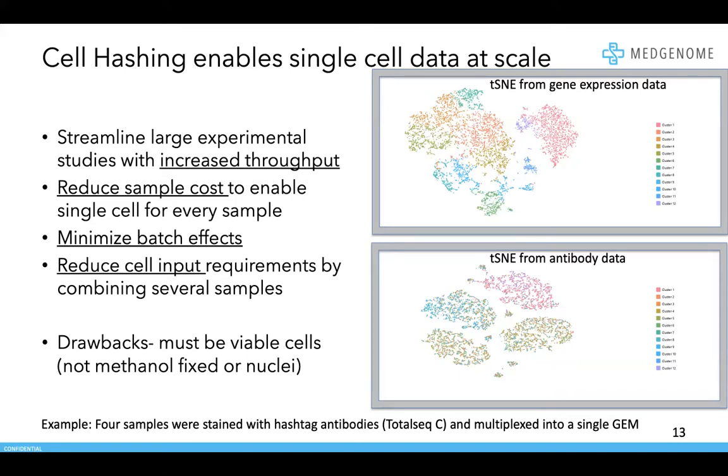And of course, then you get into problems where some of the cells or the samples might have QC issues, and we would probably have to communicate with the client to figure out whether we proceed with some of these that pass QC, or, I don't know. It gets complicated the more samples you're processing.